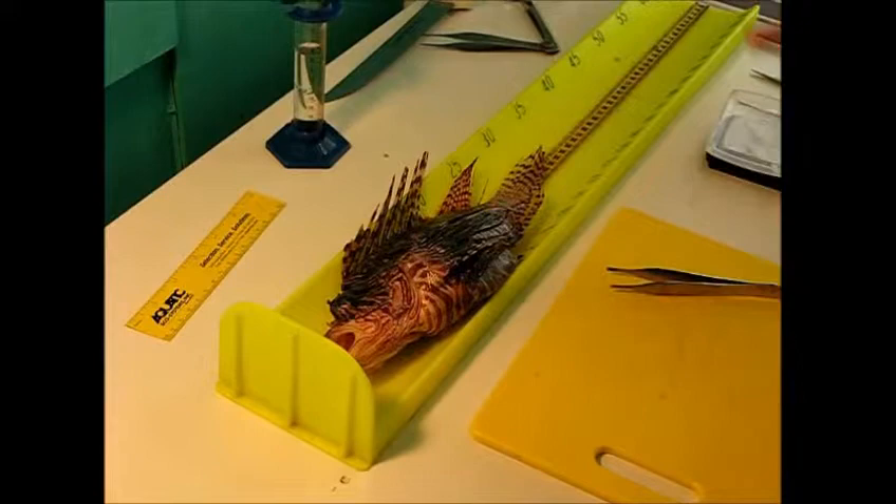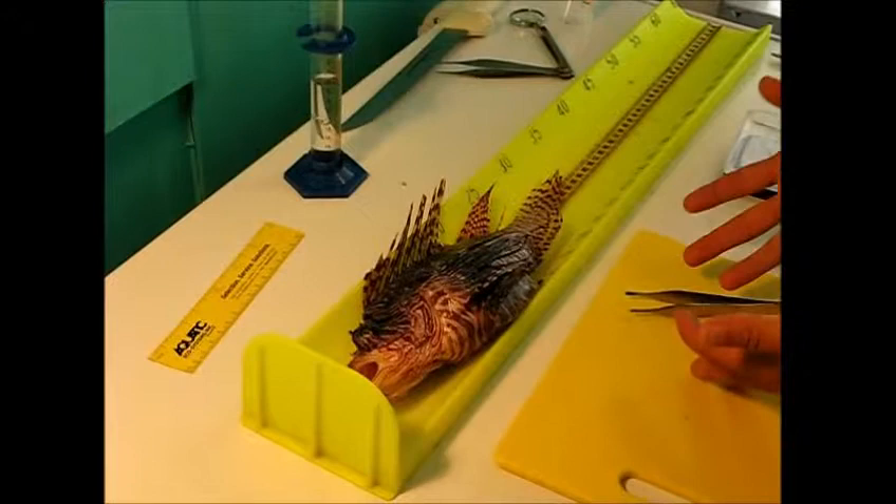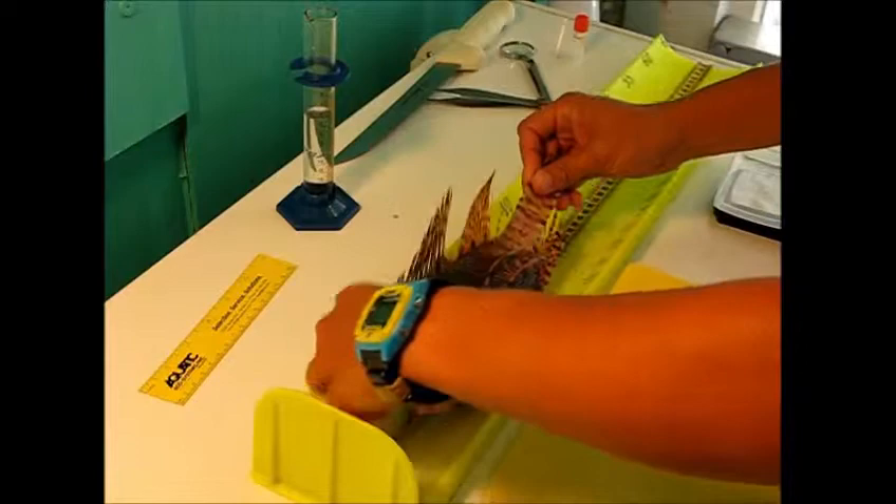Today we're going to go over how to do a very thorough lionfish dissection. The first thing to keep in mind when doing these dissections is if the fish has been kept cold on ice, these venomous spines can still sting you, so you need to take extreme caution while handling the fish.